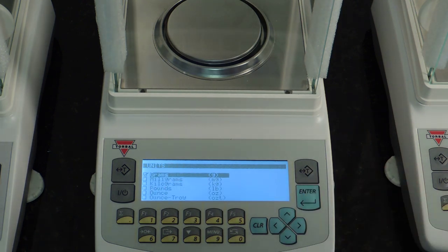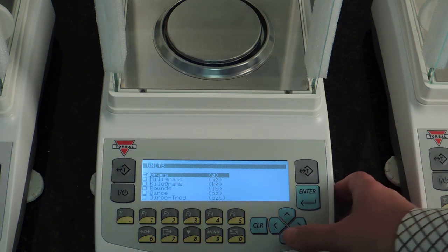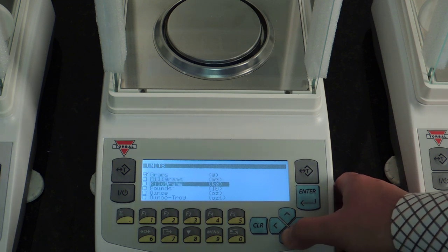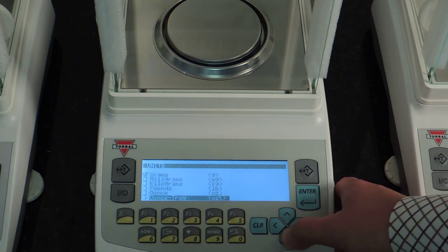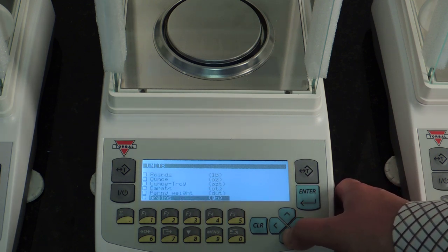We have all of the most commonly used units of measures. By default, the AGN weighs in grams, but you can have the result displayed in milligrams, kilograms, pounds, ounces, troy, carats, penny weight, and grains.